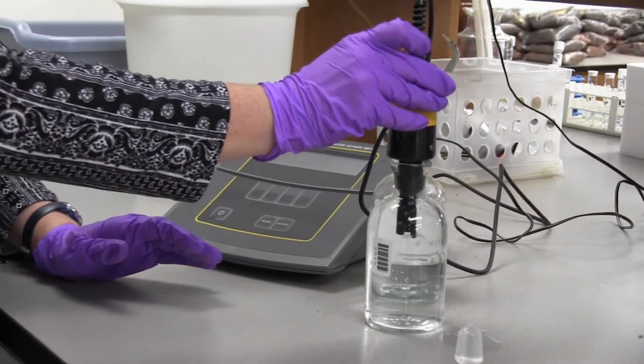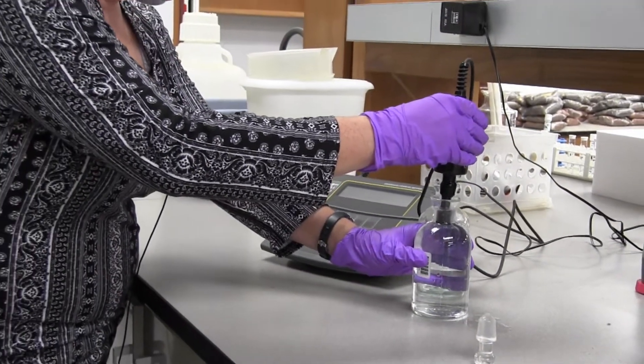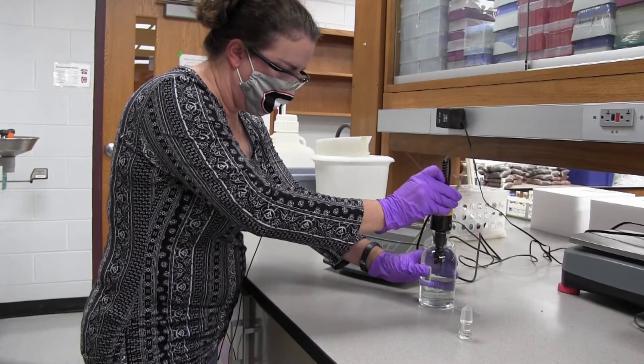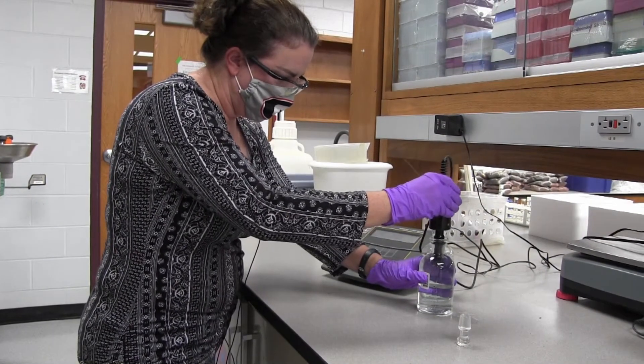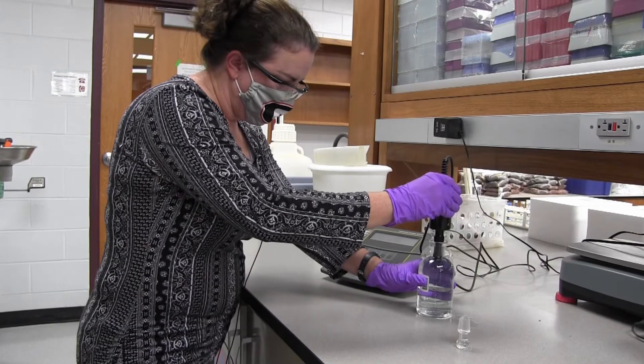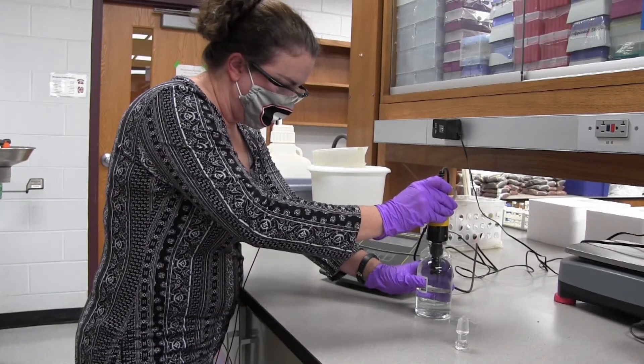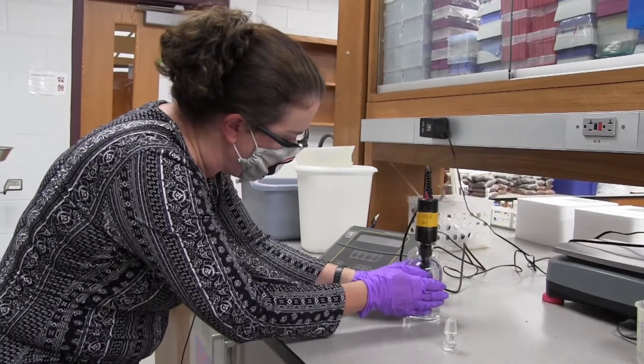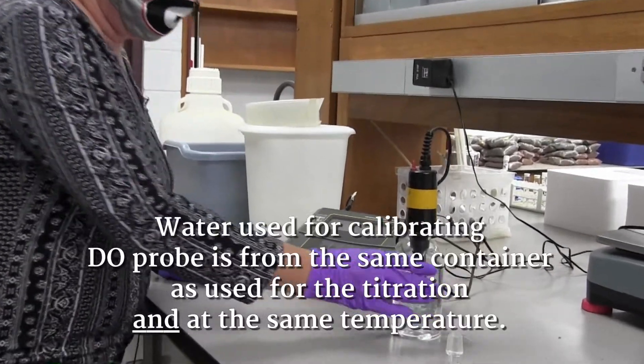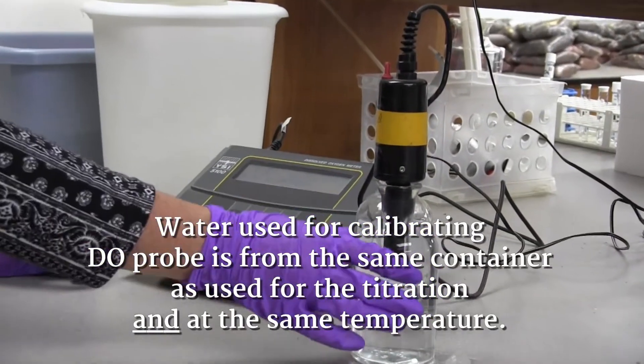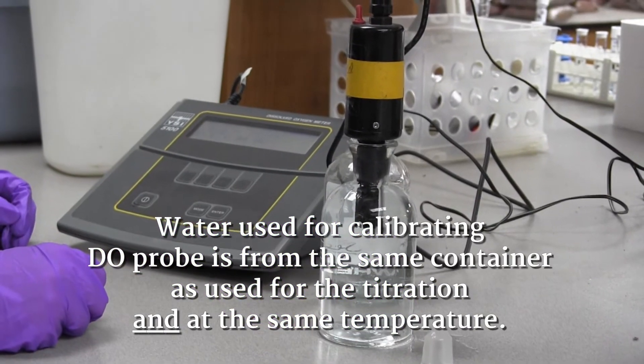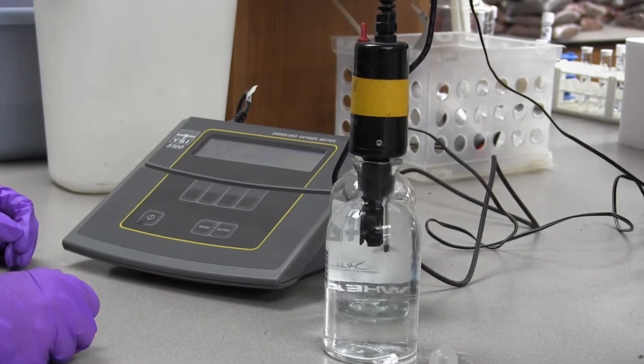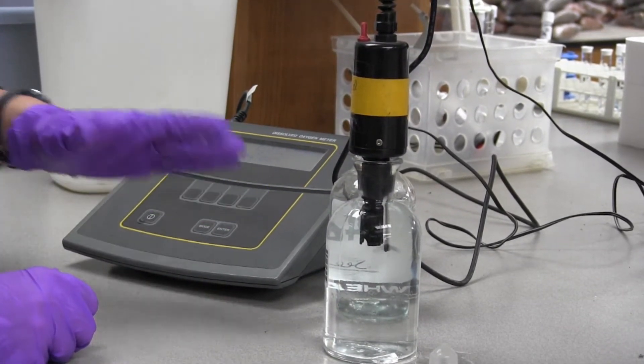I'm going to turn this on. If you have any air bubbles in the sample, just lift, turn the DO probe off, lift it up. You want to try to avoid air bubbles in here when you put the probe in the water sample. This is the extra bottle that we poured up in the Winkler when we started out with the Winkler titration. I've got this running, the probe is on. You want to let that stabilize just a moment.